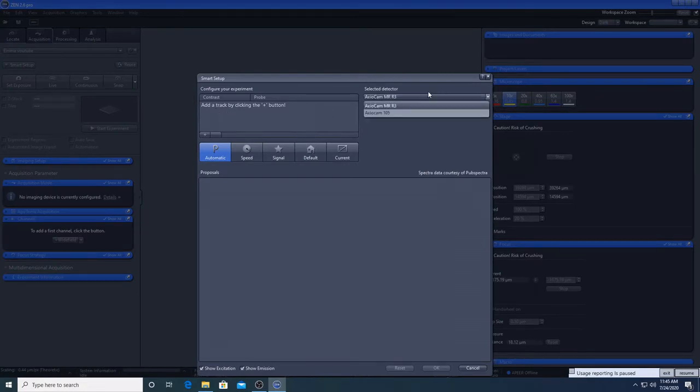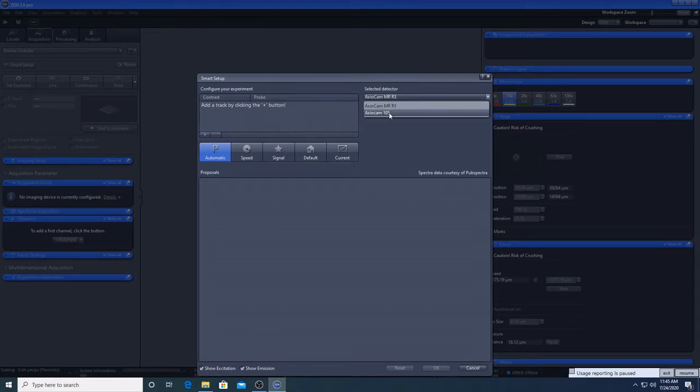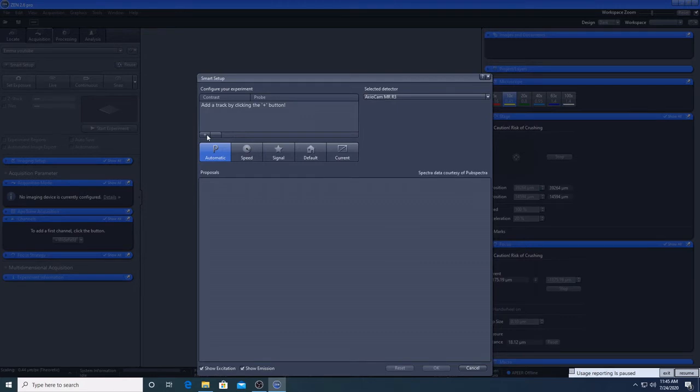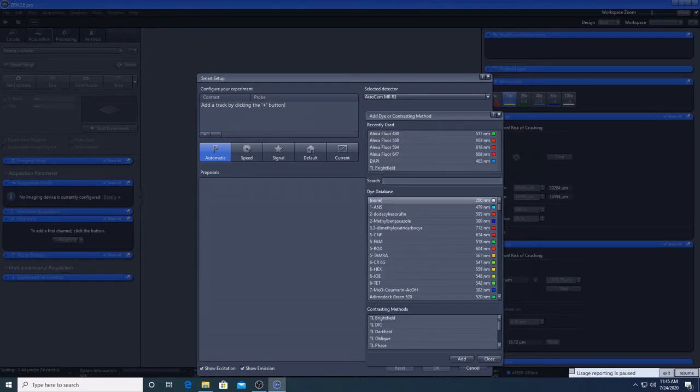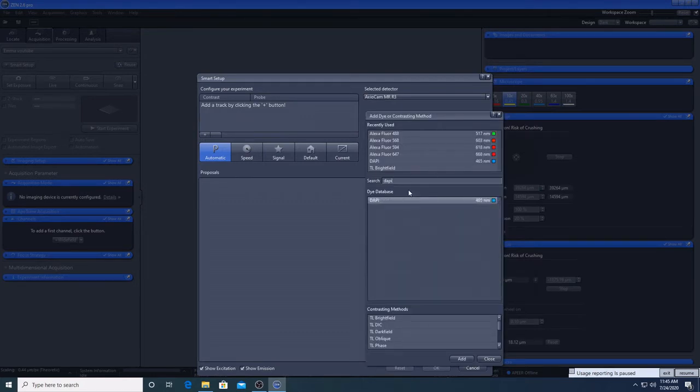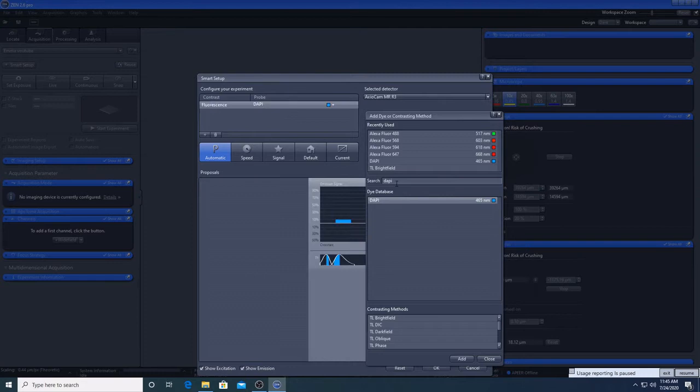We will start with an example of a setup for fluorescence imaging. First, we will select the monochrome camera Axiocam MRR3. Next, you will specify which fluorophores are present in your sample. I am using autofluorescent pollen, so I will just pick three common fluorophores: DAPI, Alexa488 and 594.